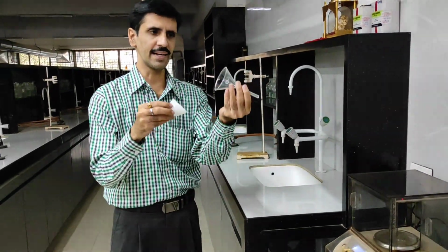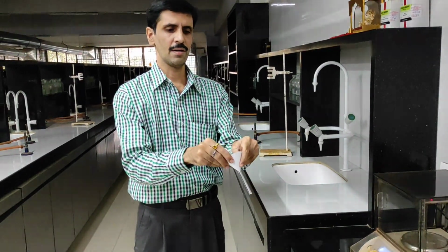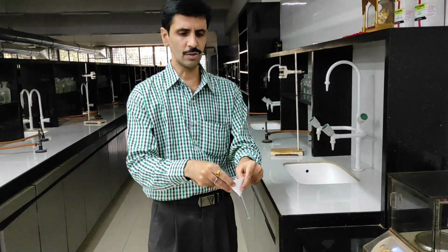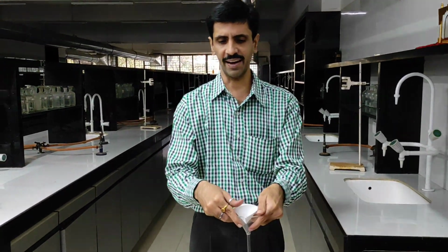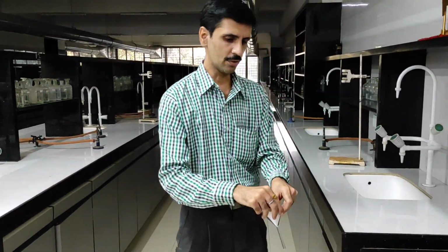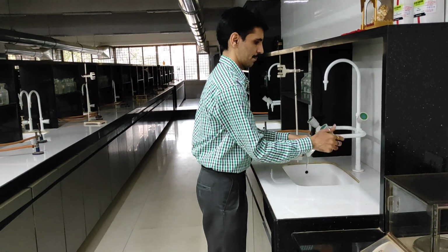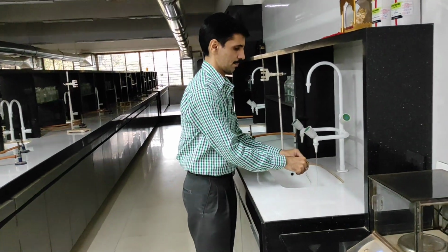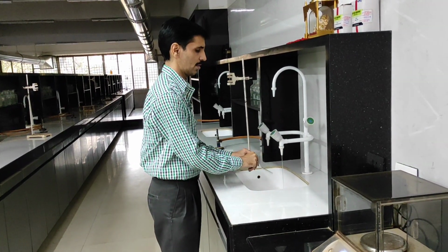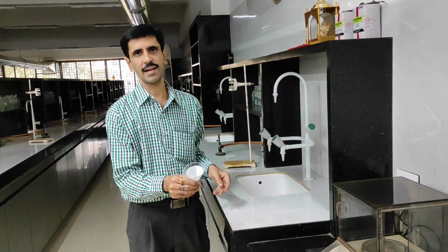This is the glass funnel that we are going to use. Okay, and we are going to insert it into it. Now, because this is in a dry state, it becomes difficult. See, it happens like this. Alright? So what we do is, we slightly moisten this. So you can check it out. It sticks to the sides of the funnel. Alright?